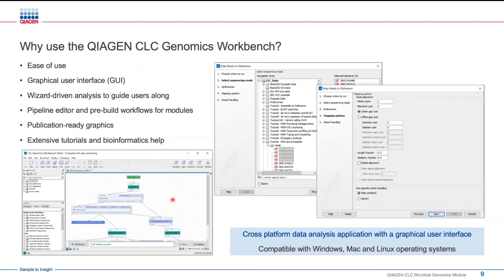The workbench itself is cross-platform compatible. I'm using a Mac machine today, but whether you're using Windows, Linux, or Mac, the Genomics Workbench is going to look exactly the same.